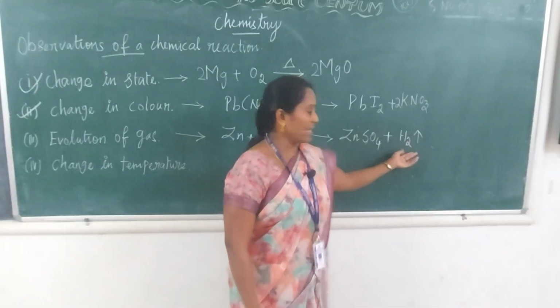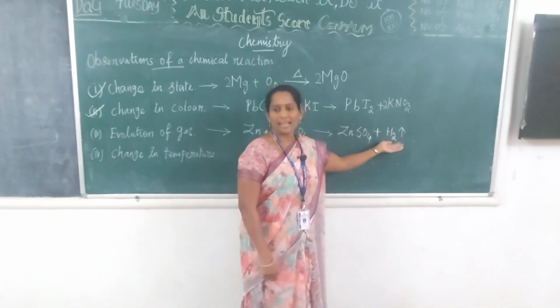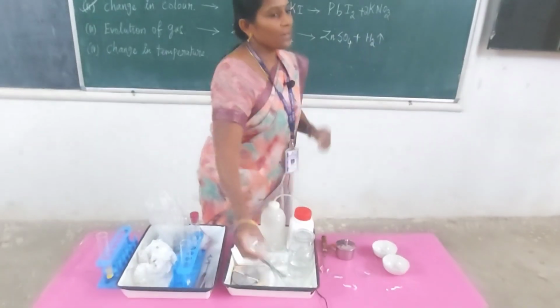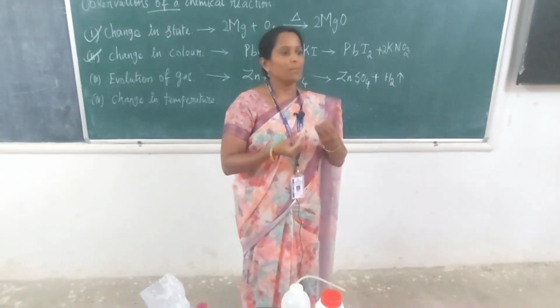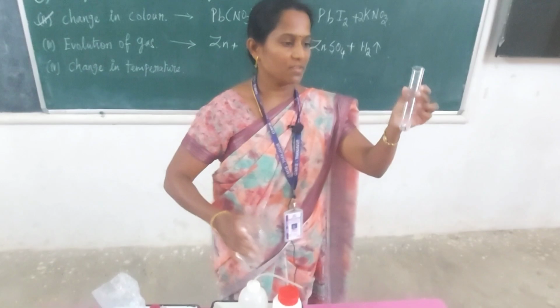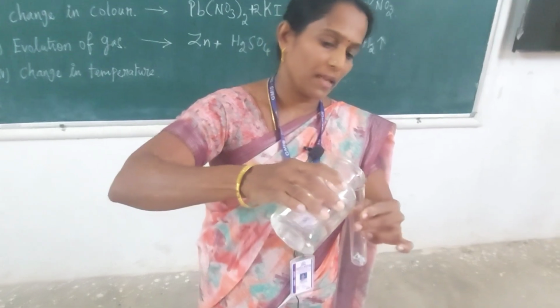In this reaction, we can't see the hydrogen gas which is evolved because it is colorless and invisible. But we can test the gas. How to test the gas? If we bring a burning candle near to the gas, it makes a pop sound. That sound indicates the gas is hydrogen. Zinc granules in a test tube. Now I am going to add sulfuric acid into it.